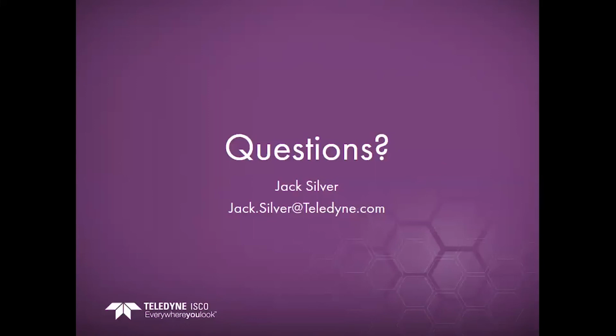Have you worked with low charge or essentially non-polar peptides, and what are your recommendations? Okay, low charge or non-polar peptides in some sense is a little bit easier. The DMSO doesn't affect non-polar peptides anywhere to the extent as it does the peptides that we were describing in this webinar.